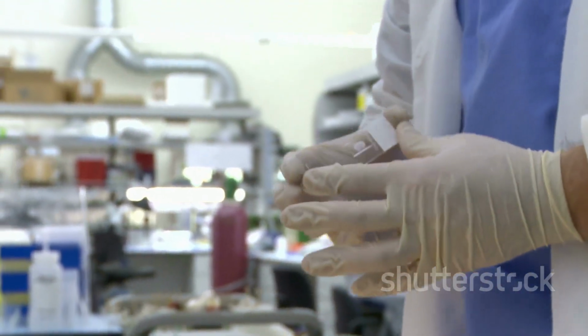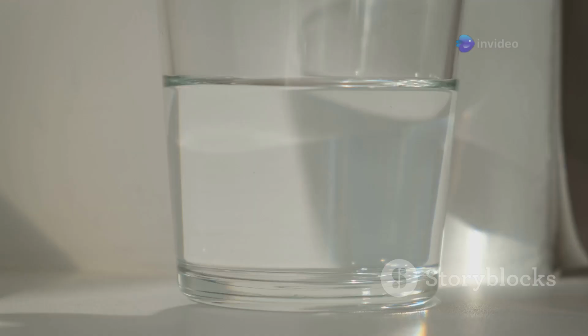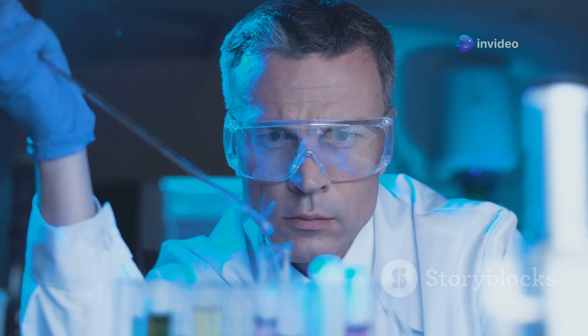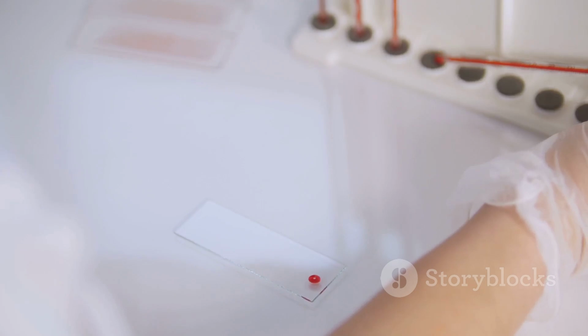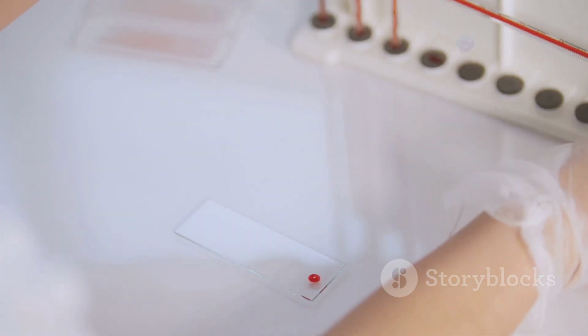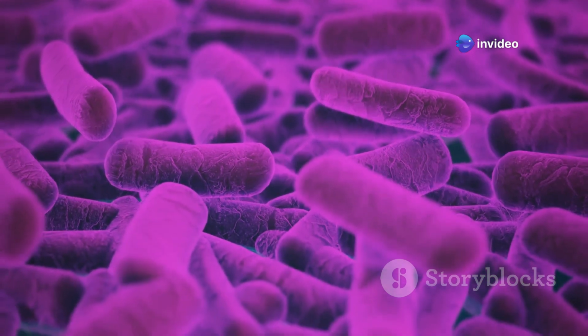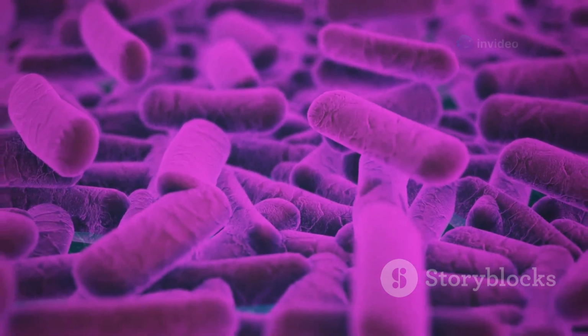Next up, we rinse off the excess crystal violet and add iodine, our mordant. Remember, this helps fix the dye onto the bacteria. We give it a few moments to work its magic, then rinse again. Now the real drama begins. We carefully apply ethanol or acetone, our decolorizing agent, watching closely as the magic unfolds. This is like a magic trick. The gram-negative bacteria will lose their purple color, while the gram-positive bacteria hold on tight.